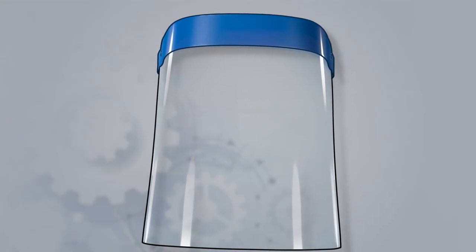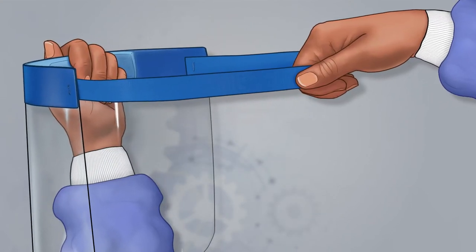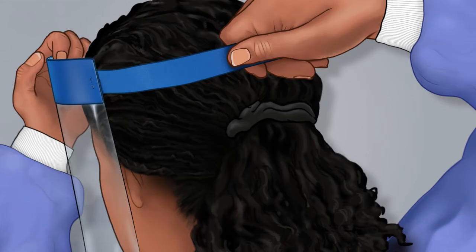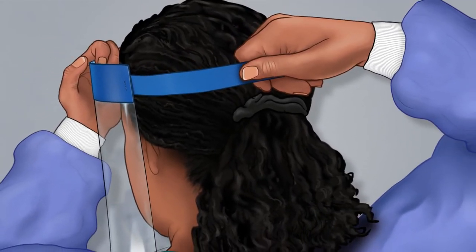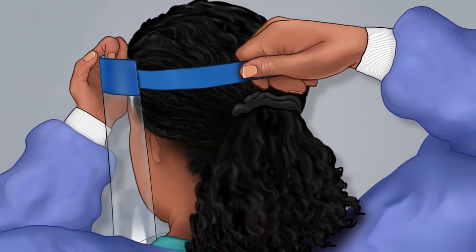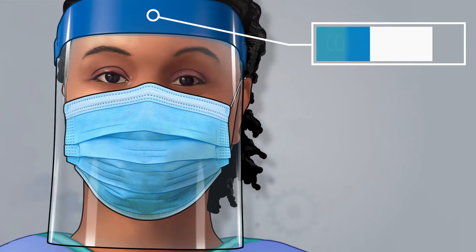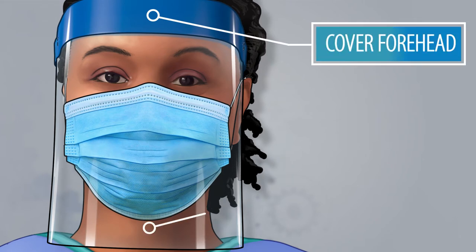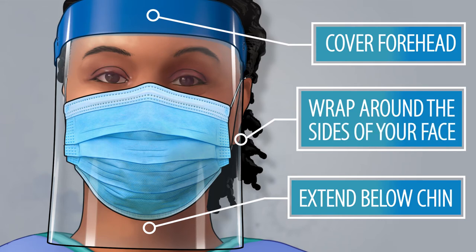Next, put on the disposable face shield. Stretch to expand the elastic strap and place it behind your head with the foam resting just above your eyebrows. Adjust the strap so it fits snugly against your face. Face shields must cover your forehead, extend below your chin, and wrap around the sides of your face.